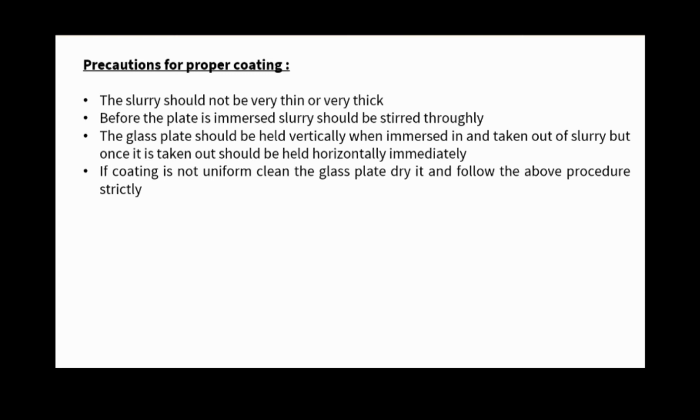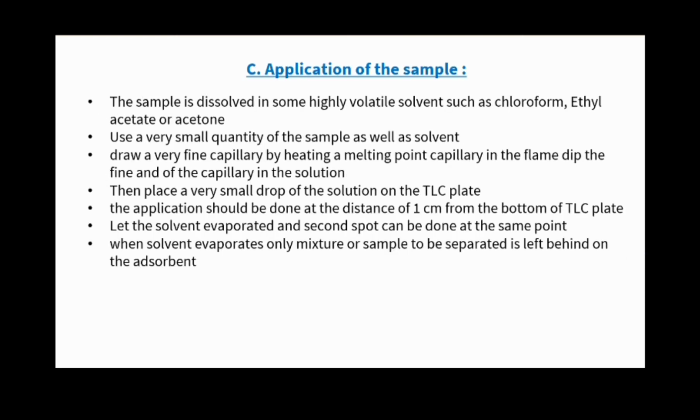we will see our next point, that is application of the sample. The sample is dissolved in some highly volatile solvents such as chloroform, ethyl acetate or acetone. The sample which we have to apply on a TLC plate, first of all we have to dissolve in a highly volatile solvent. After that use a very small quantity of the sample as well as our solvent.